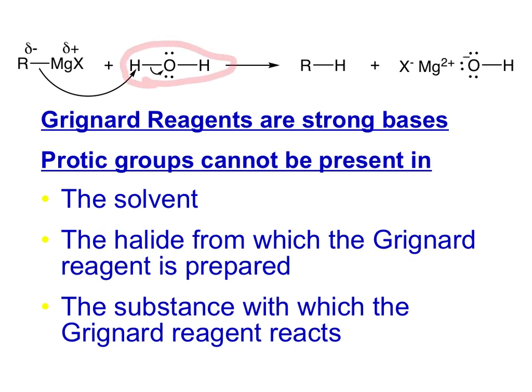We know that there's water in the air and water contaminates lots of things. And so one of our challenges is, how do we exclude as much water as possible? Because if there's any water at all, the Grignard reagent will react with the water instead of the thing that we want it to react with. And then we end up with our non-productive product, our non-reactive product.